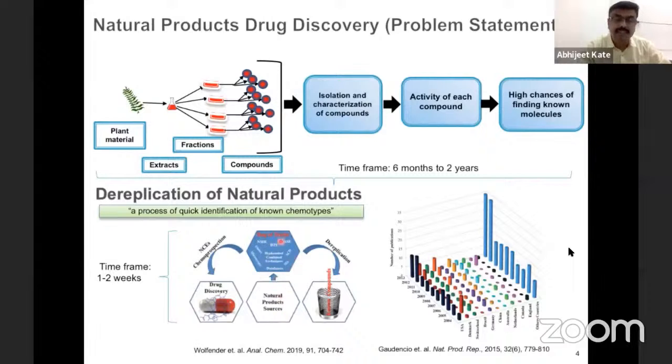There is a bag of tricks, as I said, maybe n number of things, and the most used technique I would say is LCMS and the best, LCHR. LCNMR also has been applied in several labs, but the cost is a little bit higher there. So there is also a trade-off between the cost and the application.